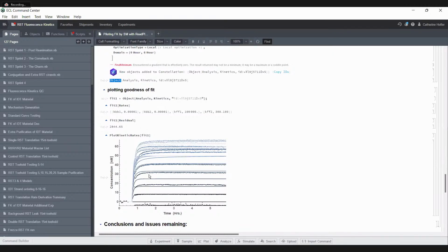So we're pretty good at the lower concentrations that I injected, and as we get higher and higher, the standard curve issues become apparent. Yeah, so that's a quick example of doing an experiment in the lab using some Mathematica tools.